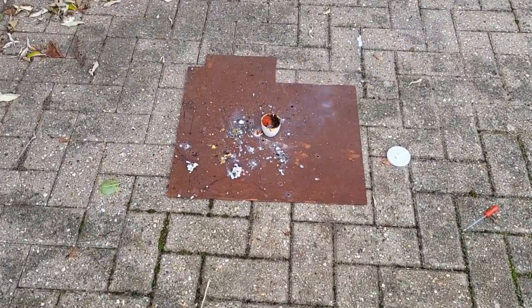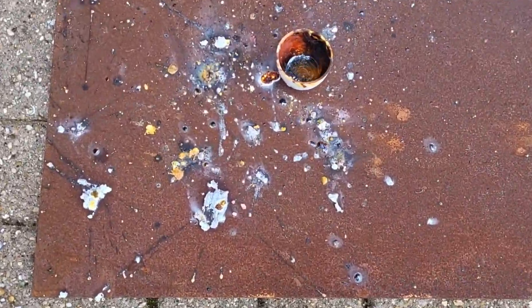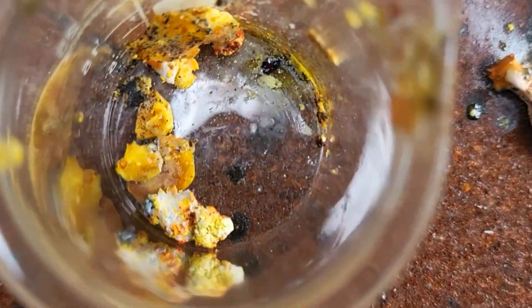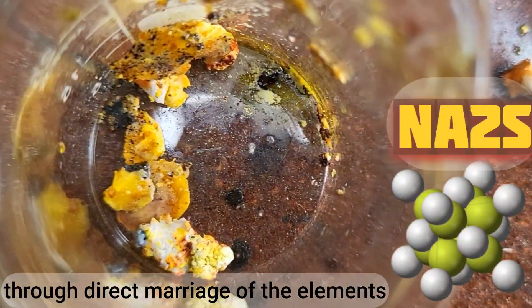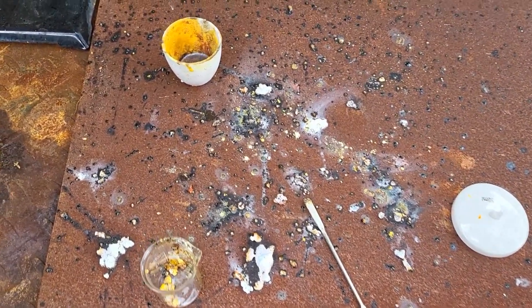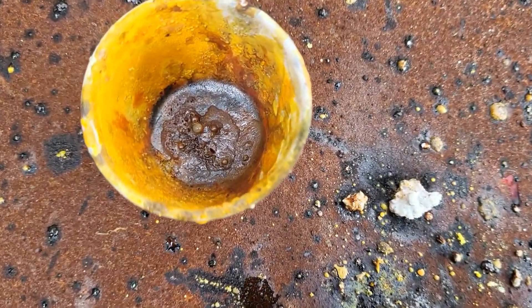We have a pretty dismal yield, but that is hopefully sodium sulfide. The white stuff could be hydroxide, and that could just be sulfur.